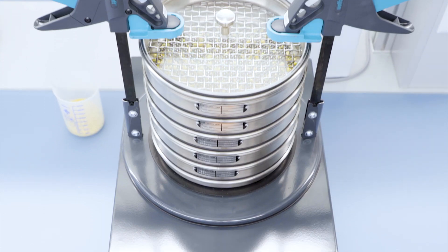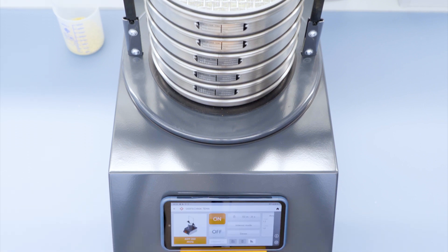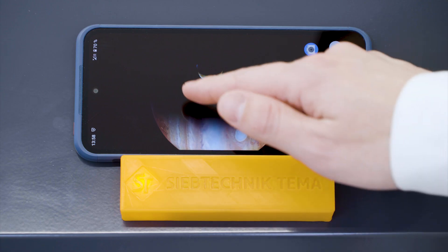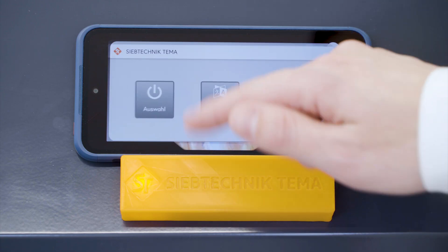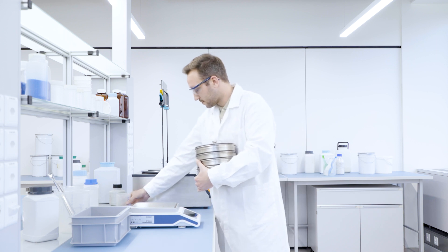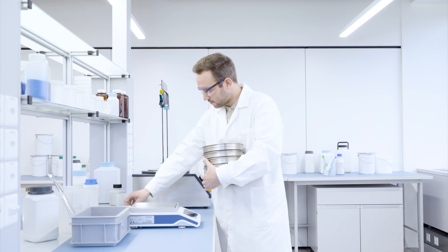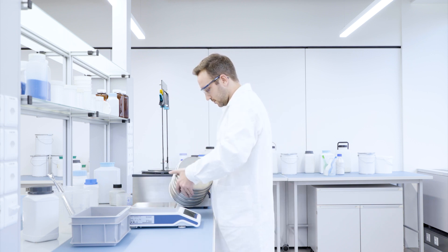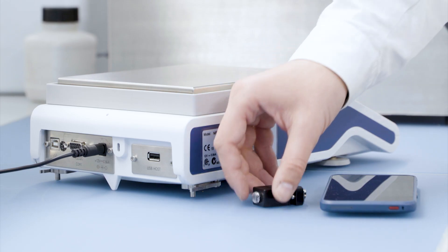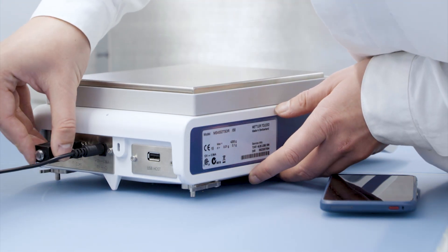The ASM200 sieve shaker combined with our LabCo app can significantly improve the productivity of your sieve analyses, as you can see in this example. With our app interface, your SOPs are always at hand, so you can start the process with a few quick steps.